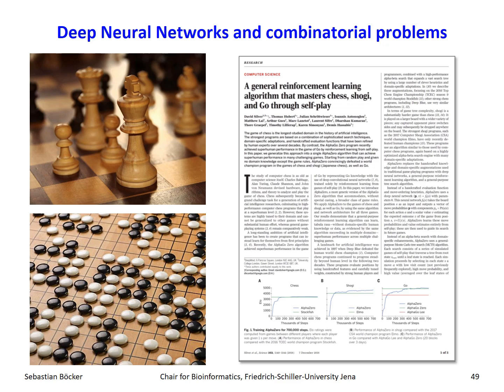And in that respect, why do I think that the mass spectrometry data from a small molecule has combinatorial things in it? Because you can have a peak at 120.1 something Dalton, and it means something completely different from a peak which is, I don't know, 5 ppm away from that, because it stems from two different fragments with two different molecular formulas. But for machine learning methods, these two peaks are mostly the same. It might be the same peak with a little bit more mass inaccuracy. That's totally possible. Machine learning is not stupid. As long as you now in your training data have examples that show that it might mean this substructure or this substructure, it will pick that up. It will learn that. But what about those cases where we don't have any training examples? And again, this is where we want to go, to novel compounds, which we cannot find by spectral library search.